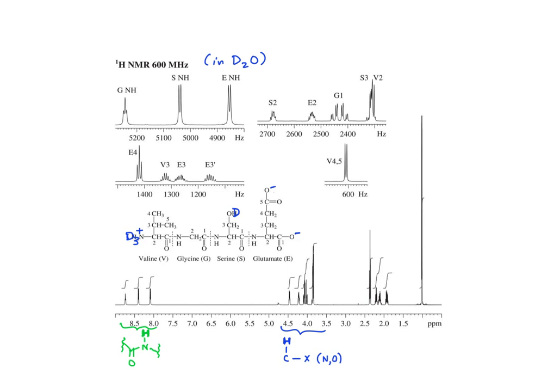And then the remaining protons are for the side chains, for protons on carbons that are not directly bonded to heteroatoms.